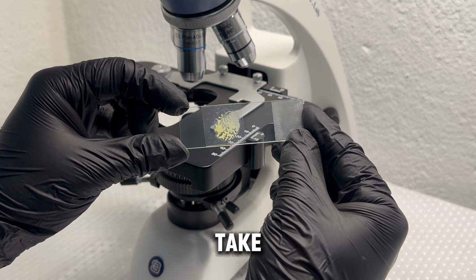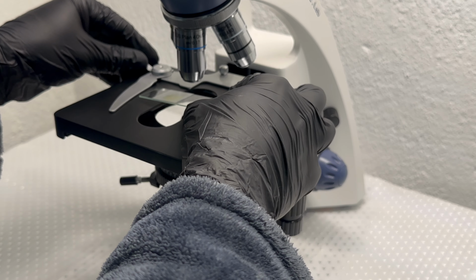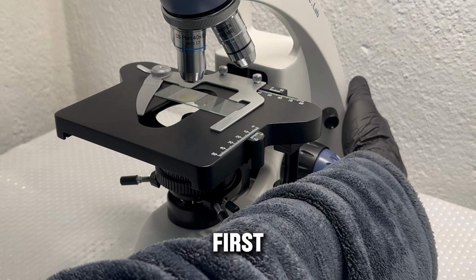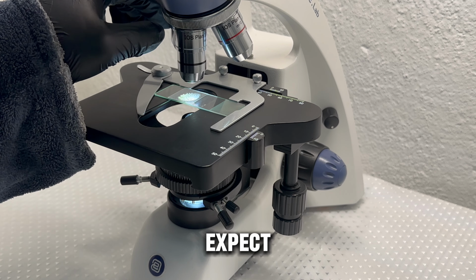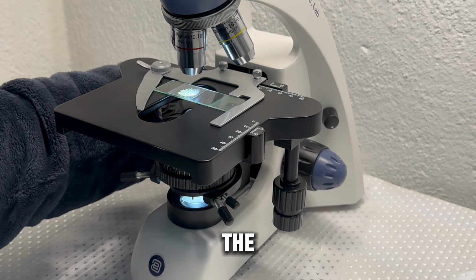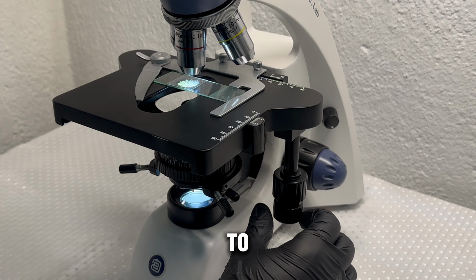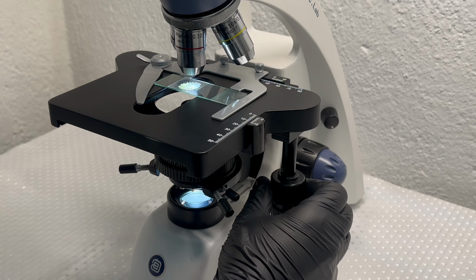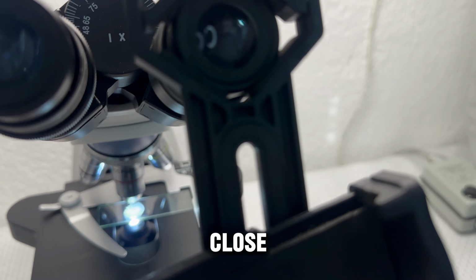In this video, I take ordinary mustard, the same kind people use every day, and place a tiny amount under the microscope. At first glance, nothing seems unusual. It looks exactly how we expect it to look. But as magnification increases, the familiar begins to disappear. Hidden structures start to appear, revealing a world we never notice. What feels simple on the plate may be far more complex when viewed up close.